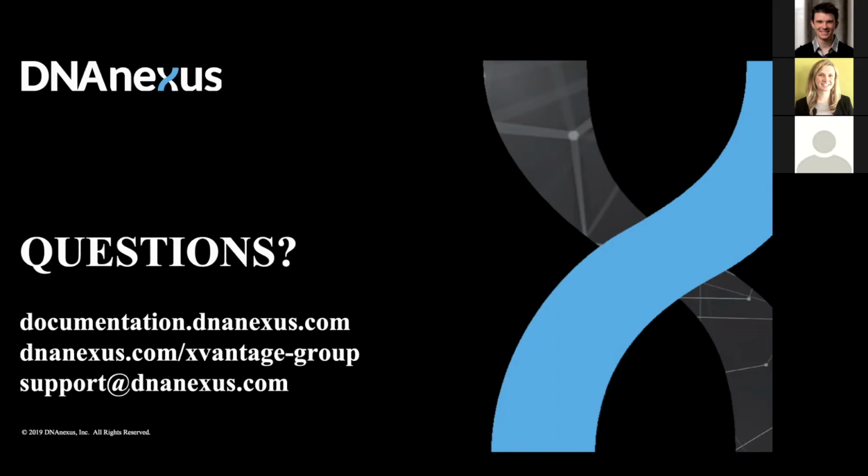If you have a workflow written in CWL, I would suggest taking a look at the documentation as well as the DNAnexus toolkit that converts your CWL workflow into a DNAnexus workflow, and you can run that workflow on the platform itself. CWL and WDL would be covered in the subsequent, more advanced webinar series, which gives you a lot of command line tips and tricks for running your WDL or CWL workflows on the cloud.